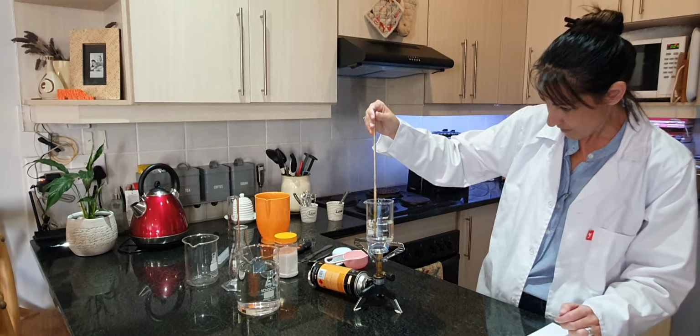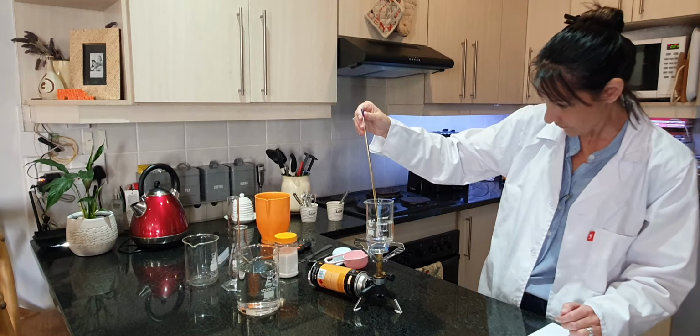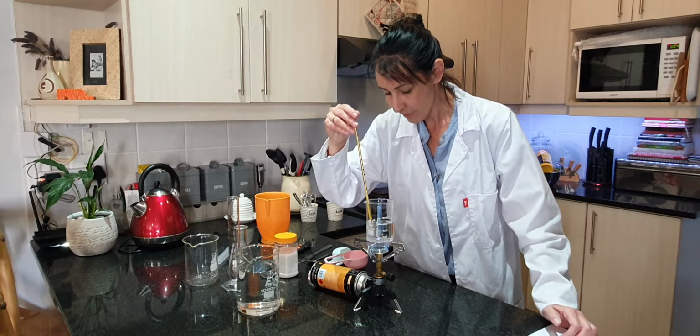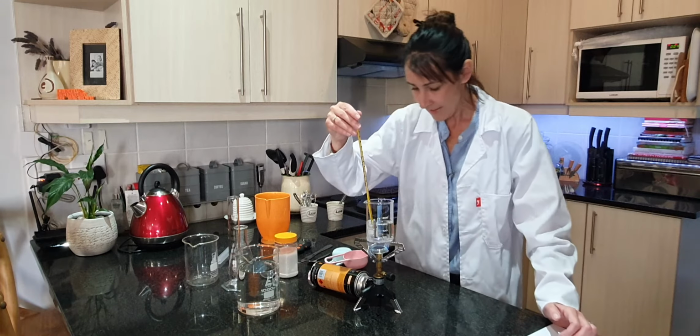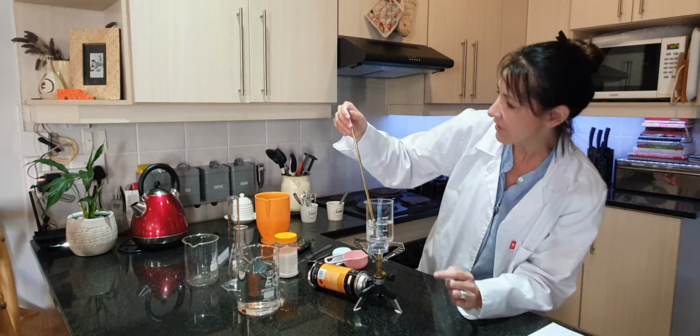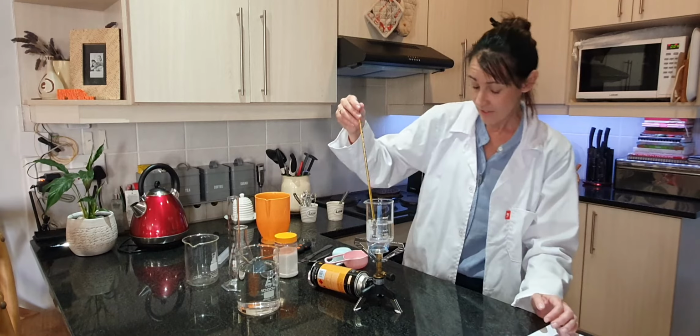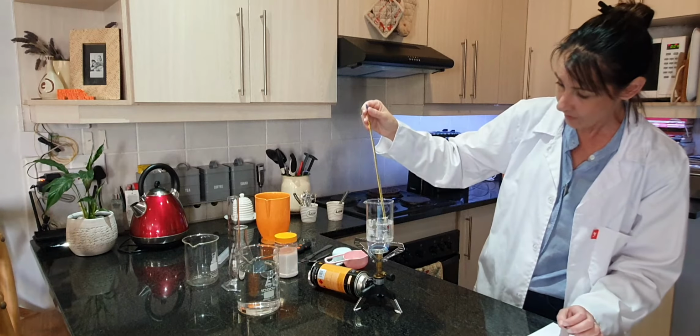Okay, let's hope I'm not missing any bubbles. Okay, and there's little bubbles there at the bottom. Okay, and there it's starting to boil. There you can see it start boiling, and we are on 99 degrees. And there you can see it started to boil quite nicely.